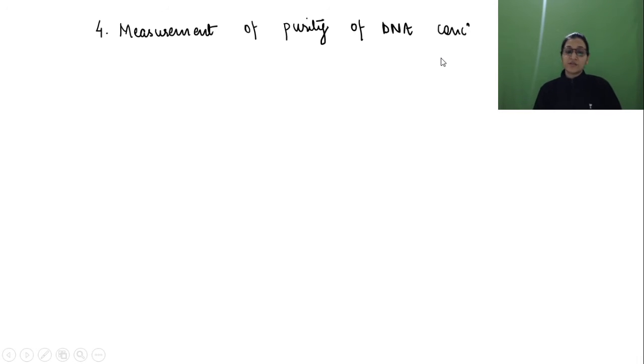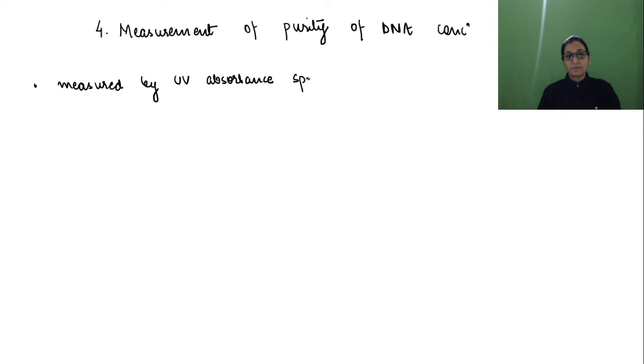DNA concentration can be accurately measured by UV absorption spectrometry, absorbance spectrometry.